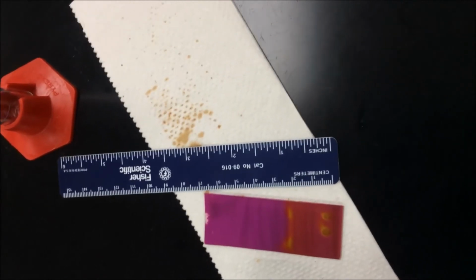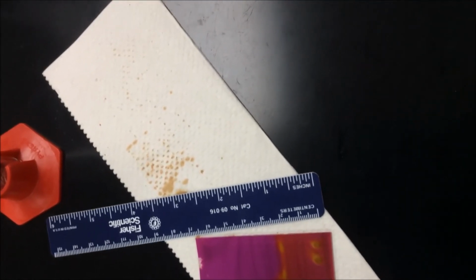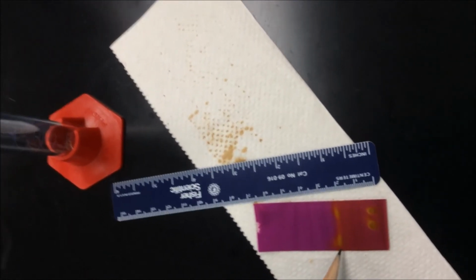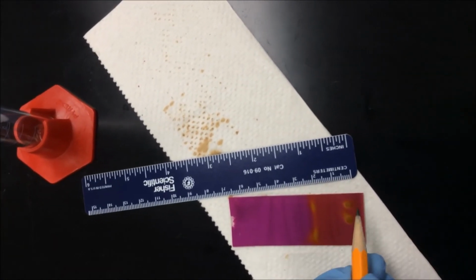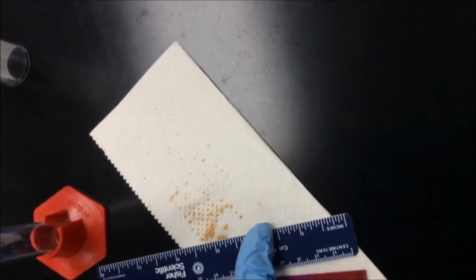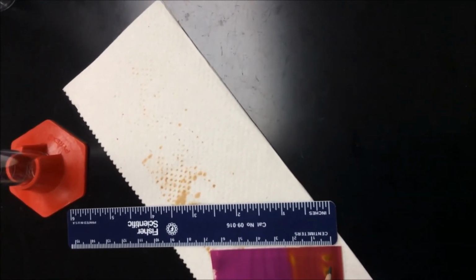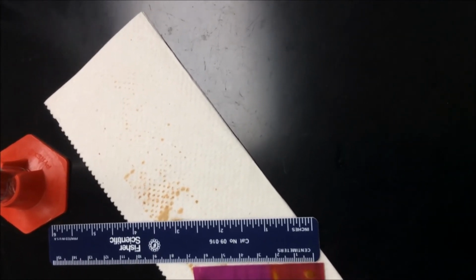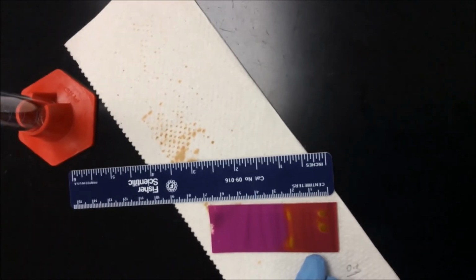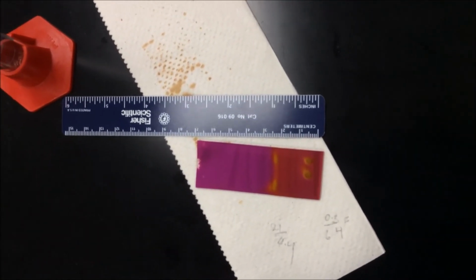So that would mean 2.1 divided by 6.4, and that is going to give me the RF of that top component, which is the orthonitrophenol. Notice this one barely moved, and so the central point of that, if I want to put a number to that, is 0.3 on the scale. So that will be 0.3 divided by 6.4, and when you find the ratio of that, that will give you the RF of the second one.